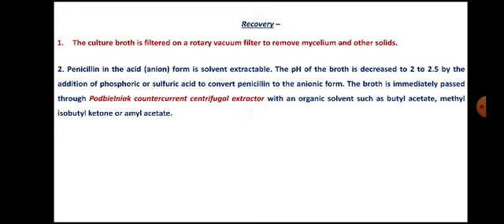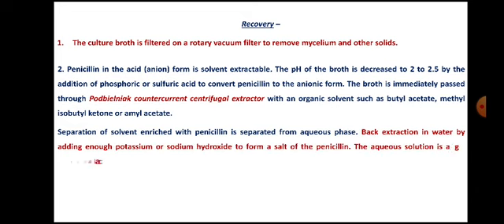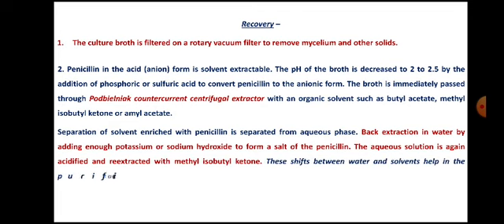We have learned about the Podbielniak centrifugal extractor, which is one of the devices used for counter current extraction of penicillin. So the solvent enriched with penicillin is separated from the aqueous phase. Penicillin will leave water and enter into that solvent.